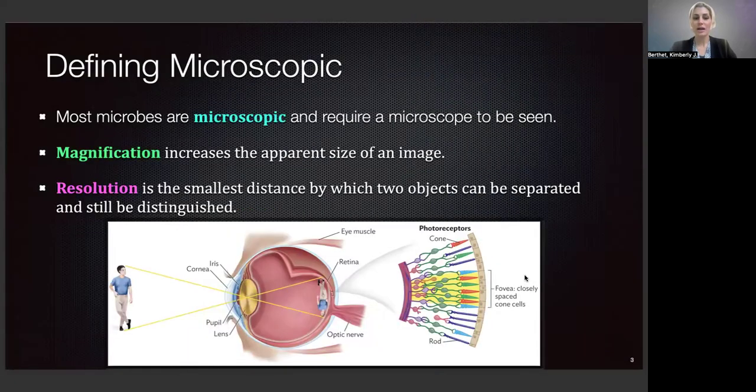To start out with, the reason why we would use a microscope is to amplify what we're seeing, to increase something in size. So looking at microbiology, the organisms that we're looking at mostly cannot be seen by the unaided eye, by the naked eye. So using a microscope as a tool to see them is going to enable us to analyze microorganisms from a visual perspective. Looking at a microscope itself, a microscope is actually quite similar to how our eye works.